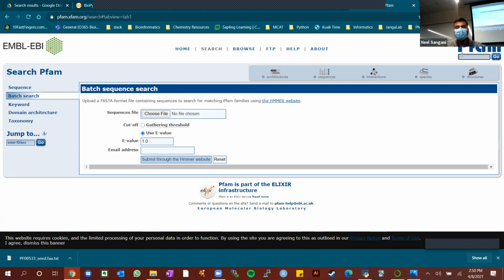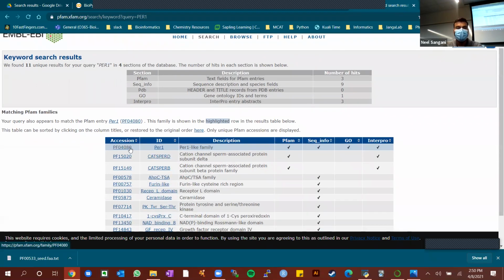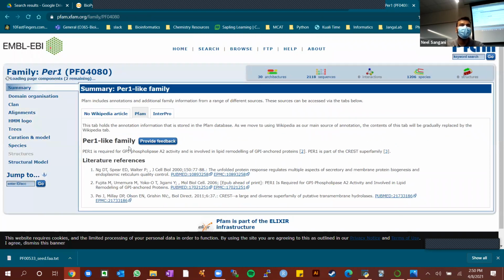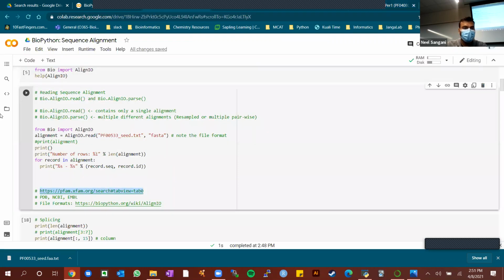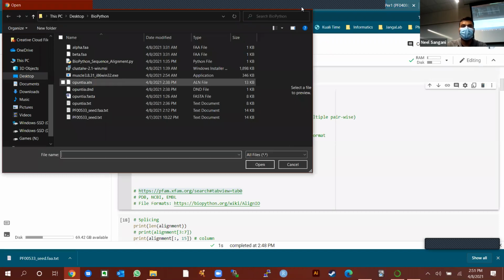That's also interesting. Yeah, when I was first looking, I was like, why is this such a small search bar in the corner? Okay, so you can go from here, right? So if we go here, then you can upload the file here, and you can upload it from here.